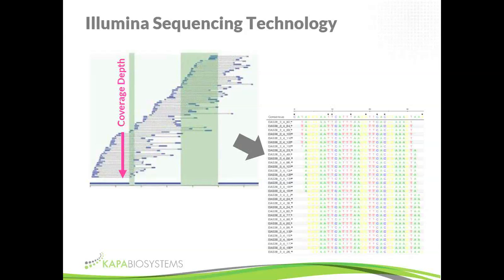And so the coverage depth depends a little bit on the application. For instance, for whole genome sequencing, you may aim to cover every position at around 30 times. Obviously, the deeper the coverage, the more confidence we have in the base identity at that position. For some clinical applications, coverage depth can go up to 100, 250, 500, even 1,000-fold.